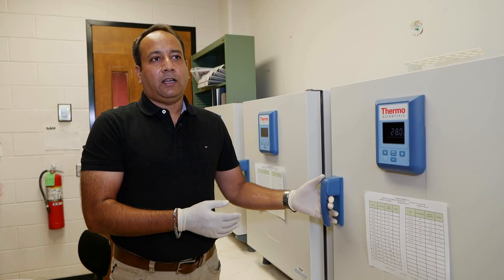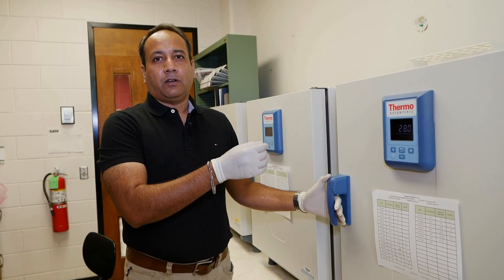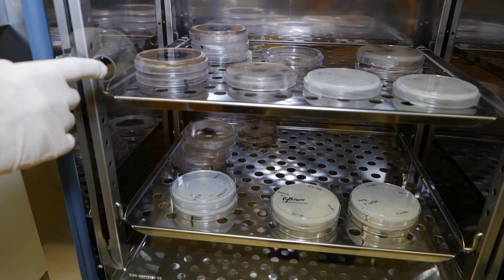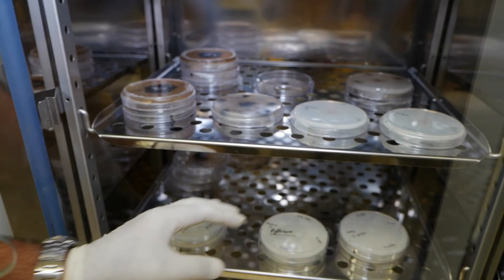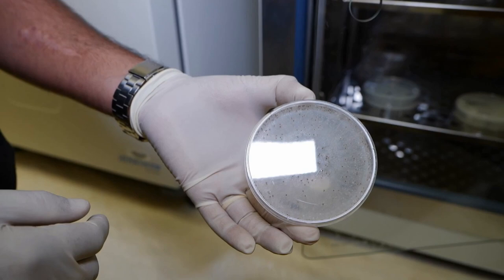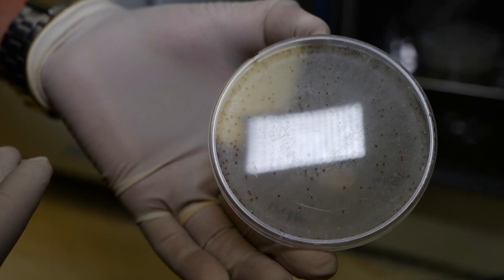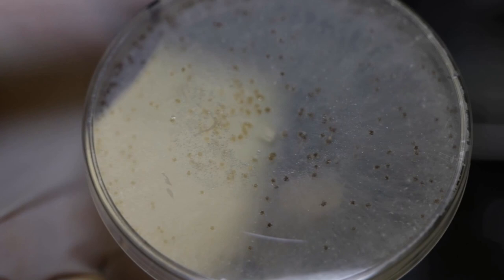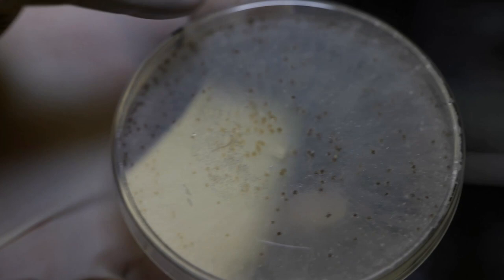Once we isolate the - once we plate the affected leaf tissue or the root tissue on the artificial media, then we bring them over here and we store them at a specific temperature so that the pathogen can start growing out of it. Here is a good example from hemp, industrial hemp. The plant was infected with the southern blight, and once we grow it on it, this is kind of a classical example where the southern blight is producing the sclerotia - mustard seed size and shape and color sclerotia. Once we see this, we are about 80 percent sure that this is southern blight.